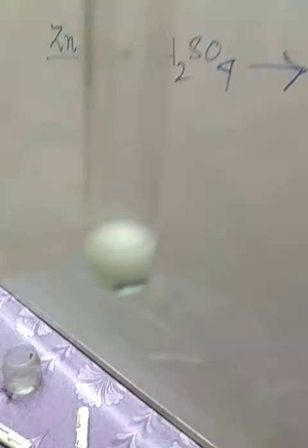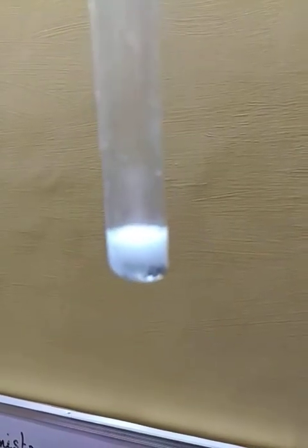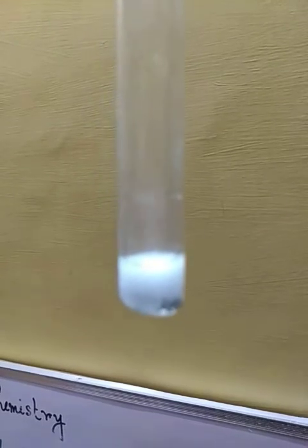A sound is coming. Hope you can understand that a kind of smoky fountain is there inside the test tube. And the sound of the production of hydrogen is also there, a very slow sound.